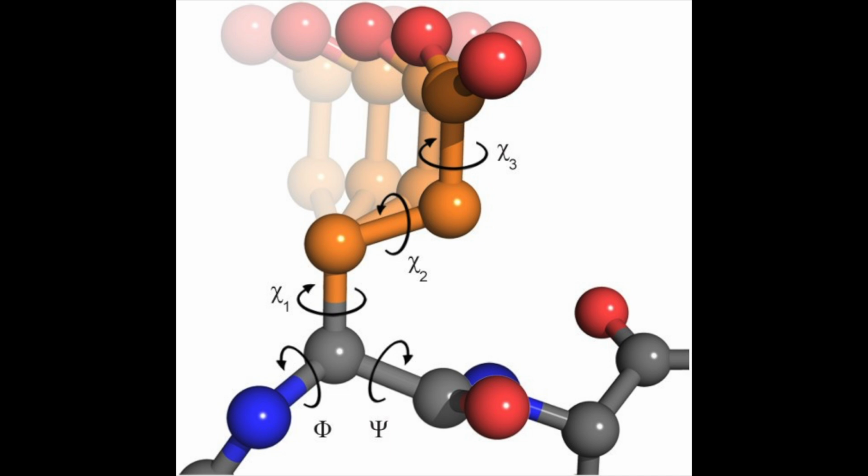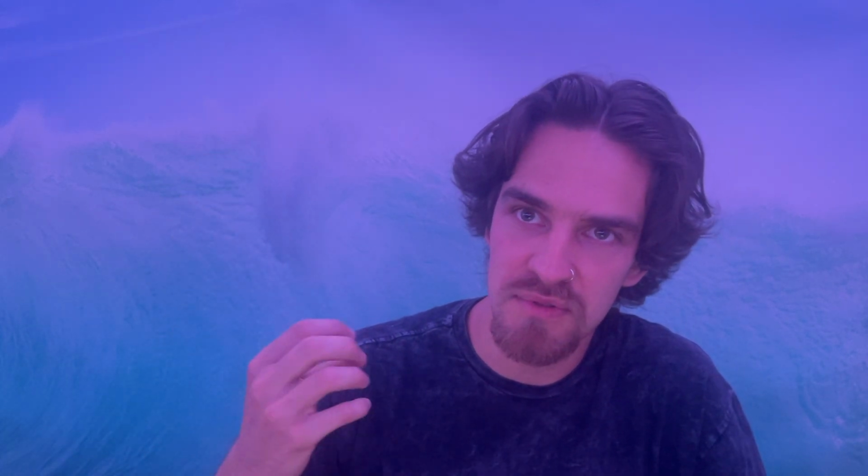Basically, for all Ramachandran outliers, we're just looking at the backbone, or basically the ribbon structure of the receptor as well as the toxin. And rotamers are looking at only the R group and seeing if all of the bond angles of the R group make sense. So basically, we're just going through the entire structure of this receptor, and we're double checking that the bond angles that fit into the EM density map the best were also conducive to what we know bond angles should be possible based on our current understanding of the laws of physics.